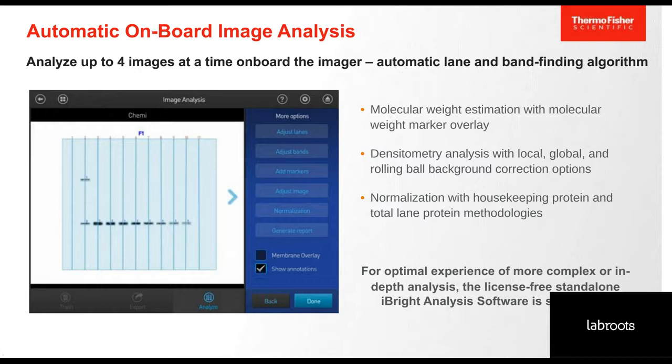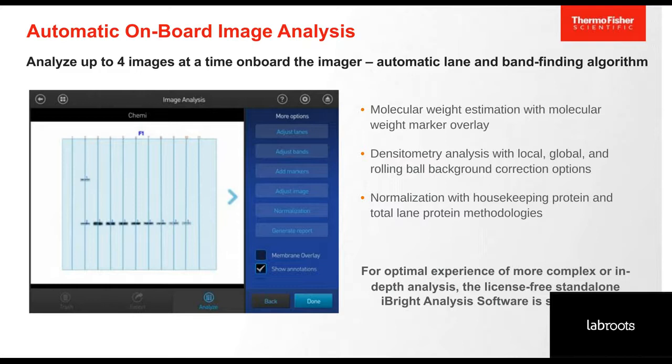Our imagers allow onboard image analysis to individually analyze up to four blots in an image. All our imagers are capable of imaging multiple samples at a time, so we allow image analysis to have that same flexibility. We provide analysis software onboard as well as standalone, which is able to individually analyze all four samples imaged together, but they can also be analyzed separately. On the instrument, we have basic analysis capabilities including densitometric analysis, molecular weight estimation, and normalization. For extensive analysis, we offer standalone iBright image analysis software.